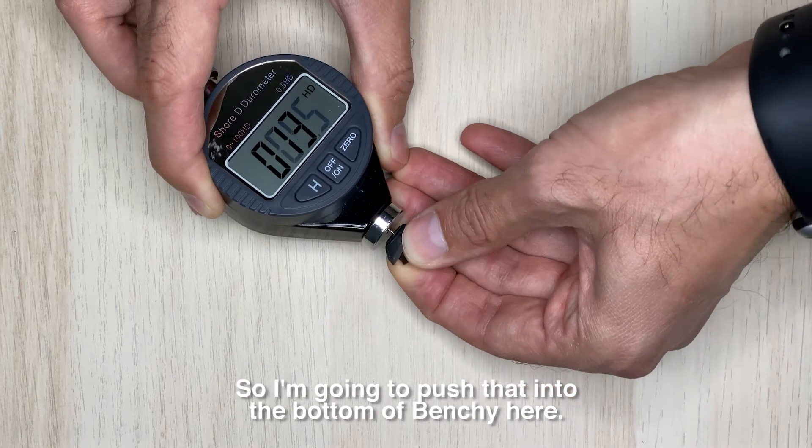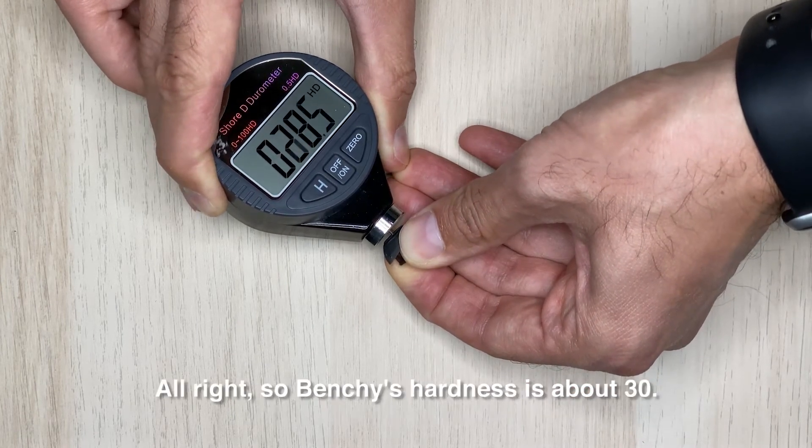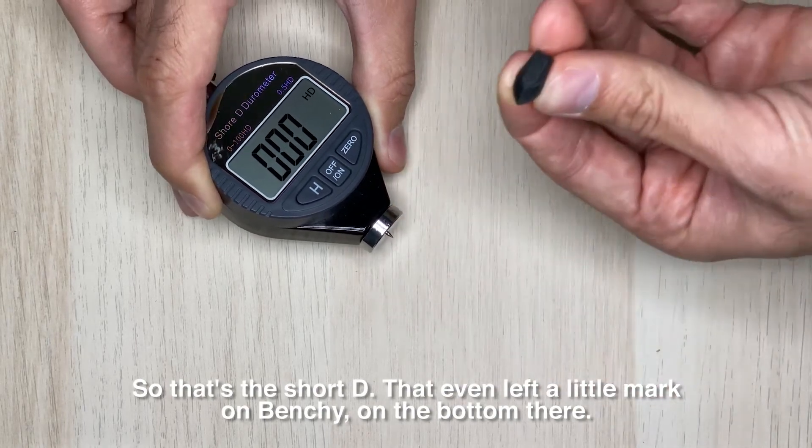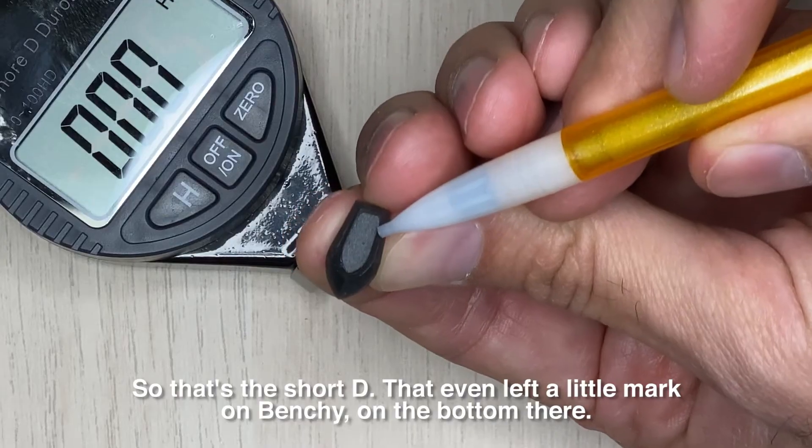I'm going to push that into the bottom of Benchy here. Benchy's hardness is about 30 Shore D — and it even left a little mark on the bottom of Benchy.